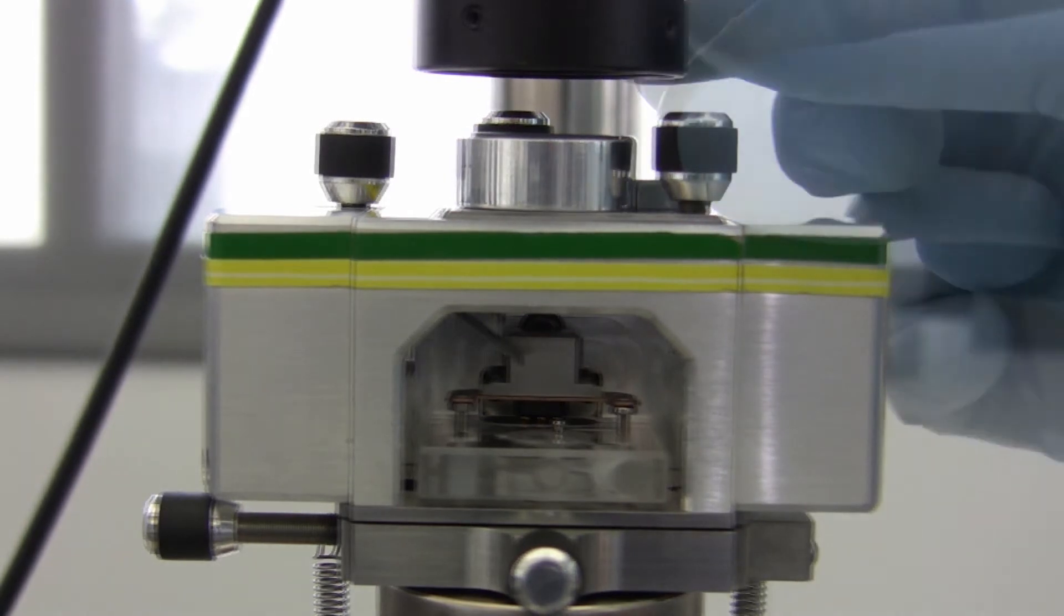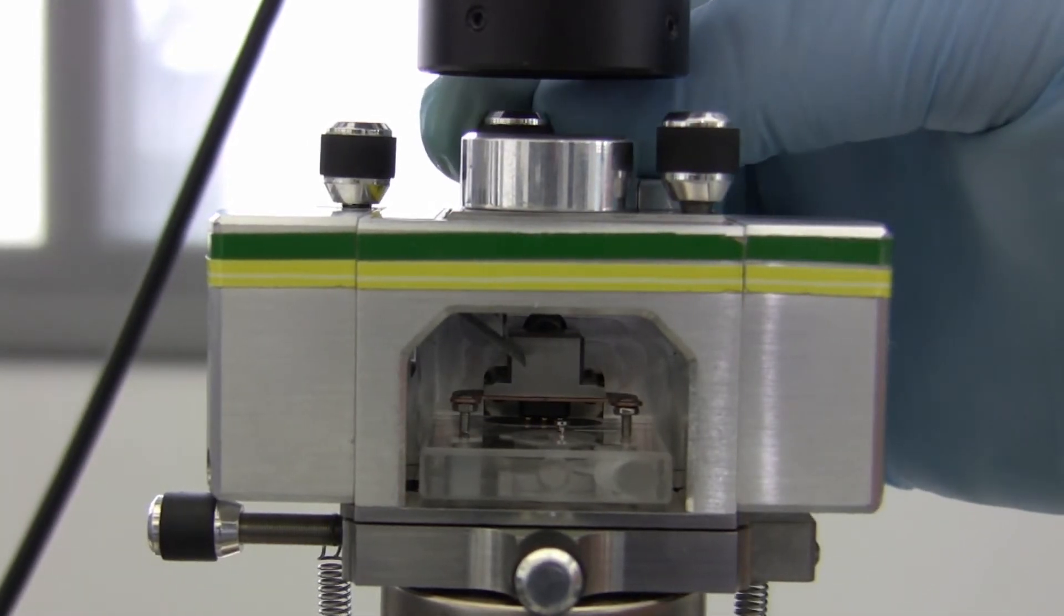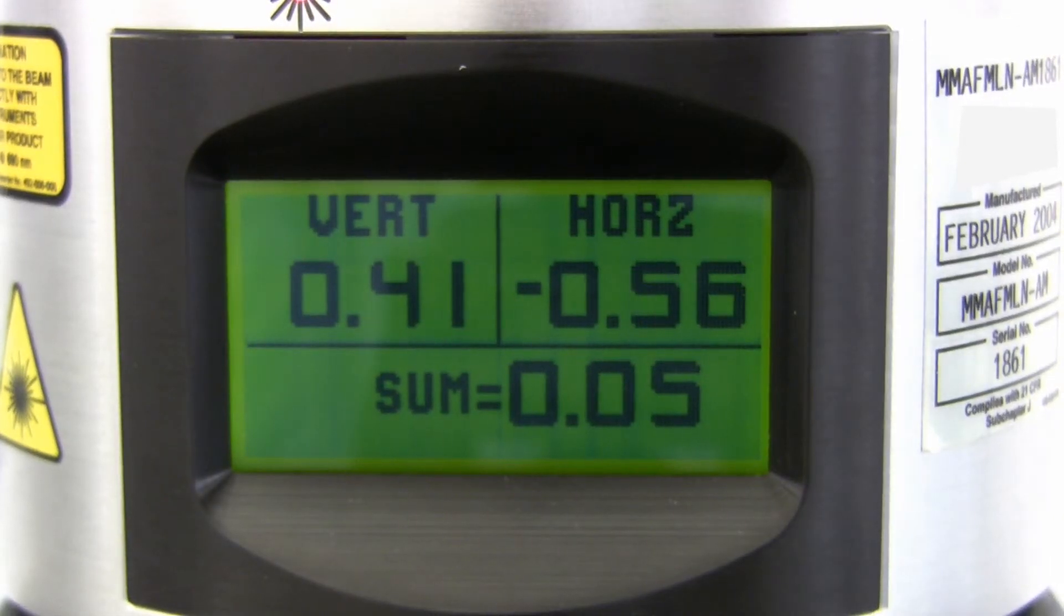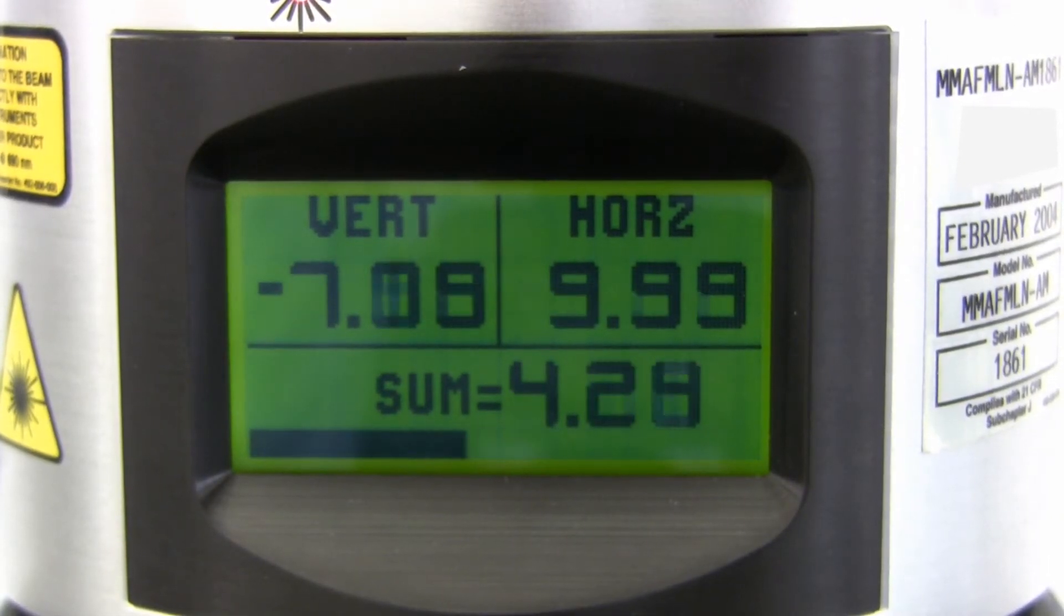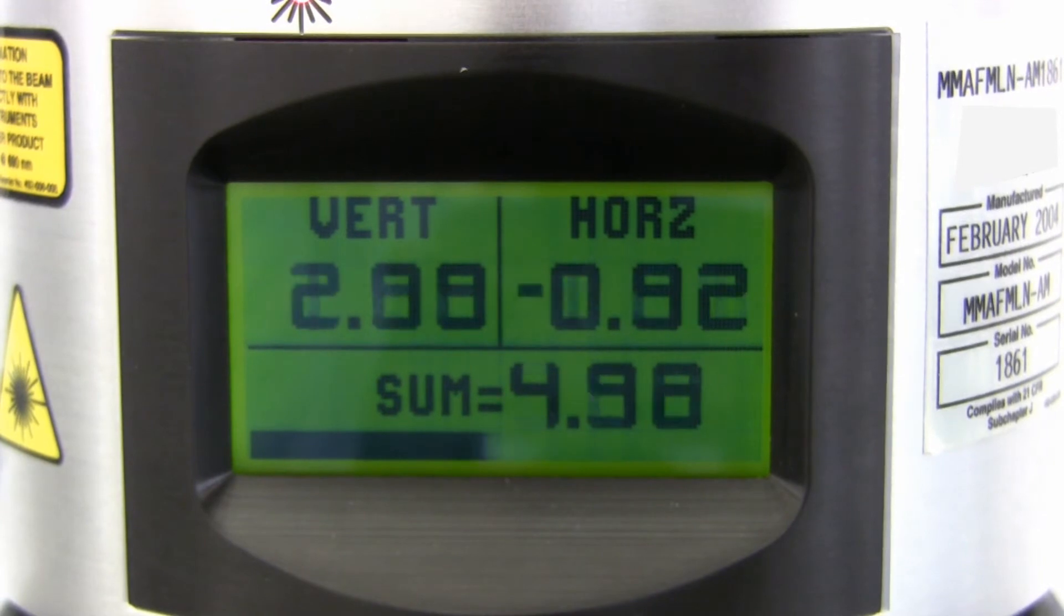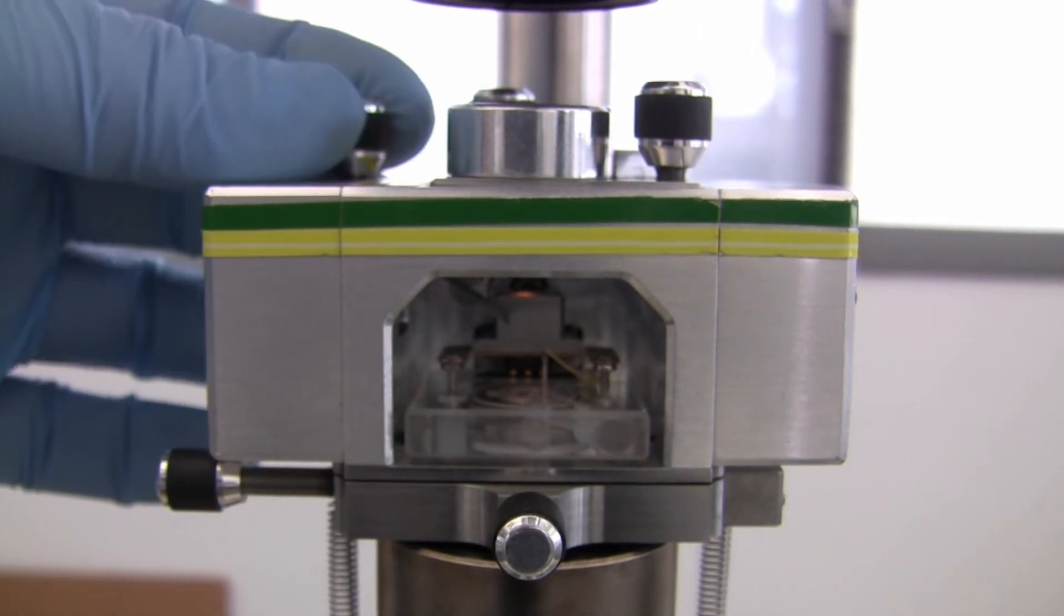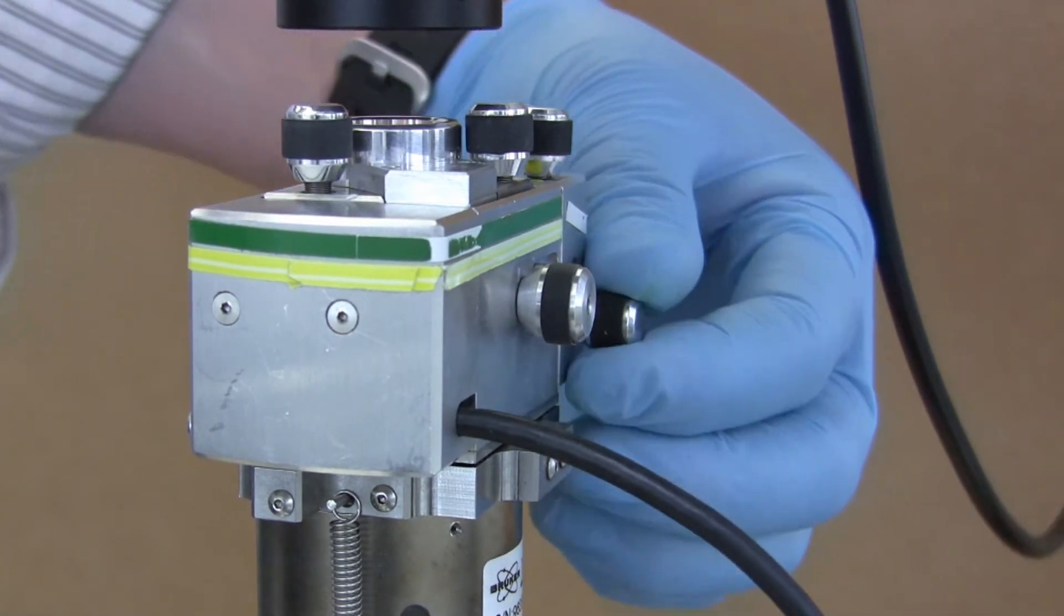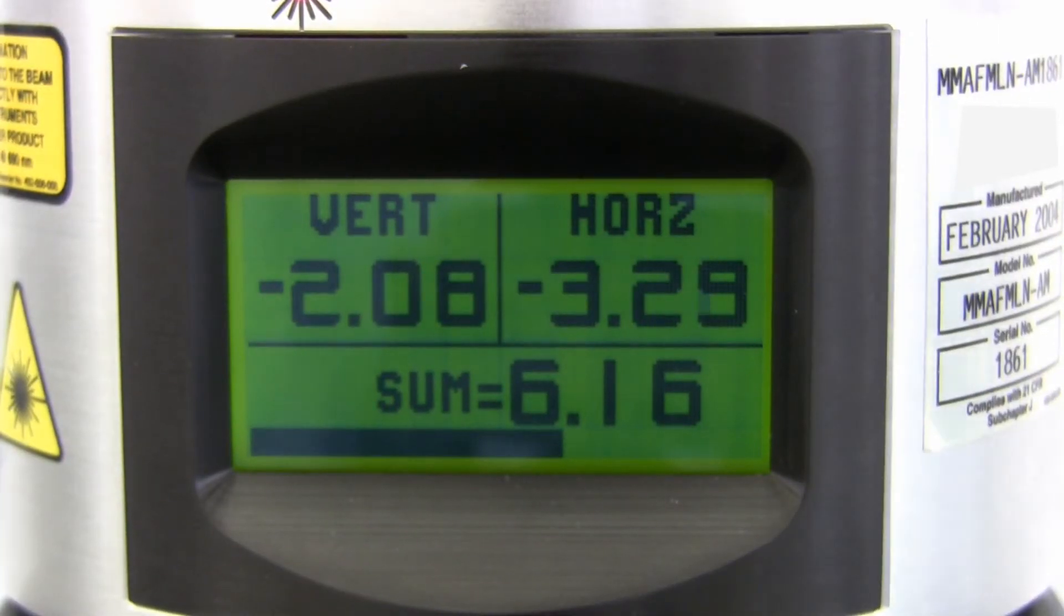Adjust the laser positioning knobs to center the laser spot onto the probe. Watch the sum value on the LCD display to observe when the value increases. Rotate the detector position knobs on the top left and rear of the head to center the vertical and horizontal signals as close to zero as possible.